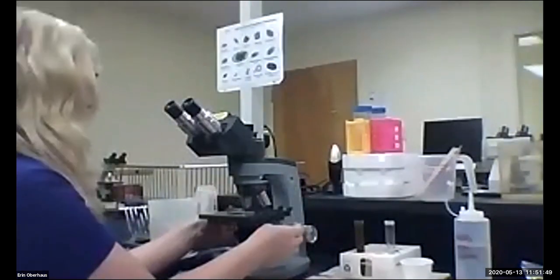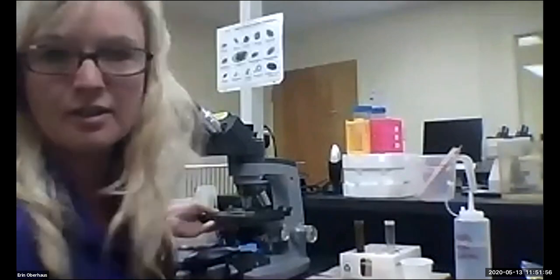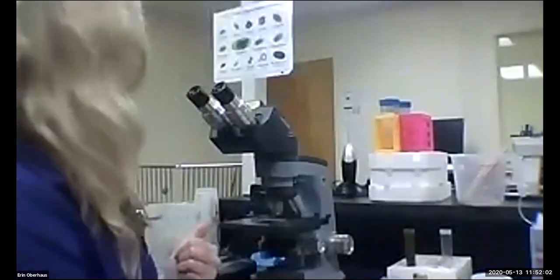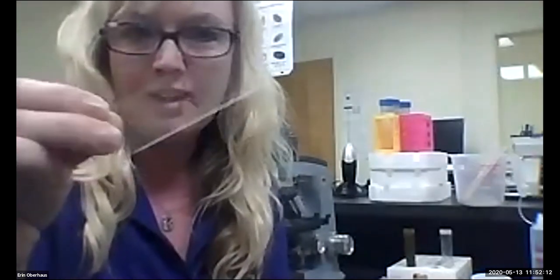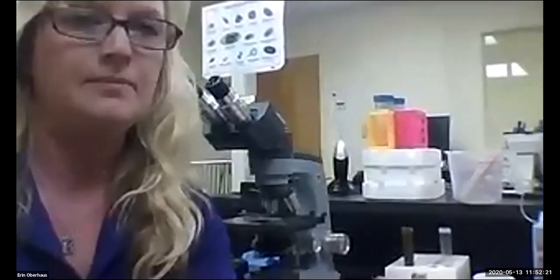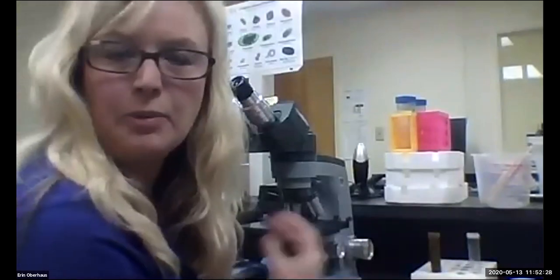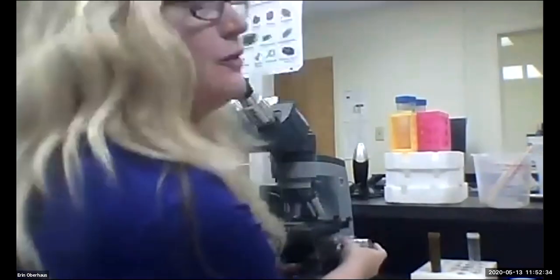But when you're visualizing, if you're new to microscopy, it can be a little daunting. You have the stage here. I always like to tell students, work on getting yourself focused first. Sometimes if you want to, take a microscope slide and put a Sharpie X on it, something that gives you color that you can clearly identify, and you have a coarse focus on the side. Can you see everything? A coarse focus and a fine focus. That slide with an X on it might help you get acquainted with your microscope and how to focus it with both the coarse focus and the fine focus.